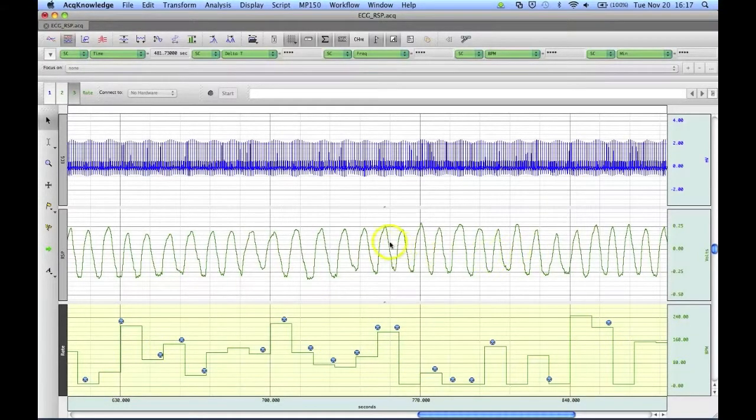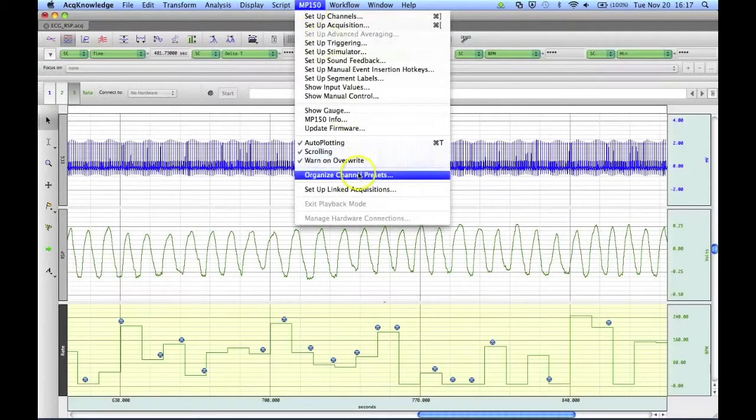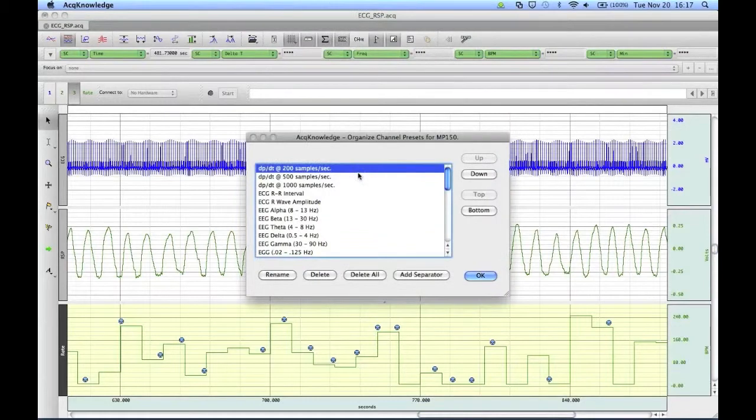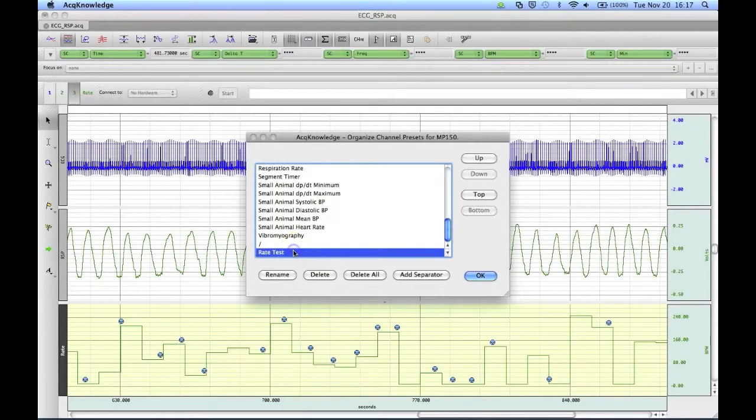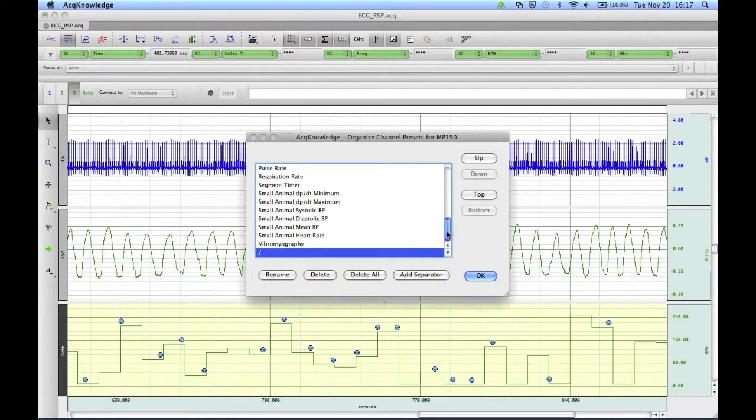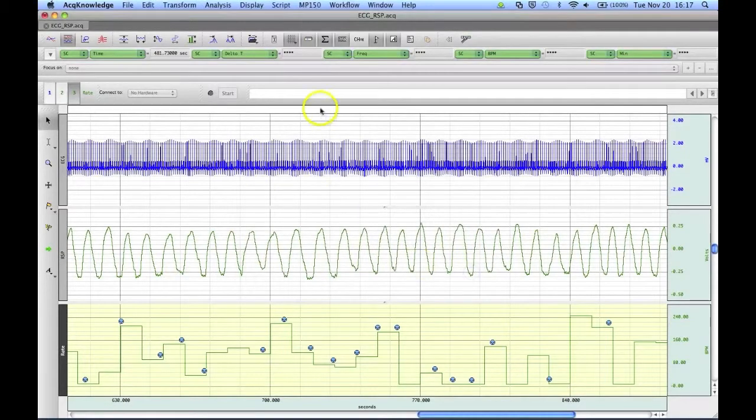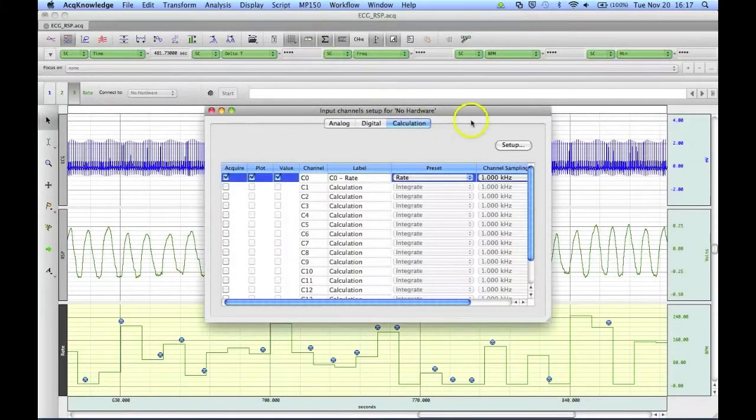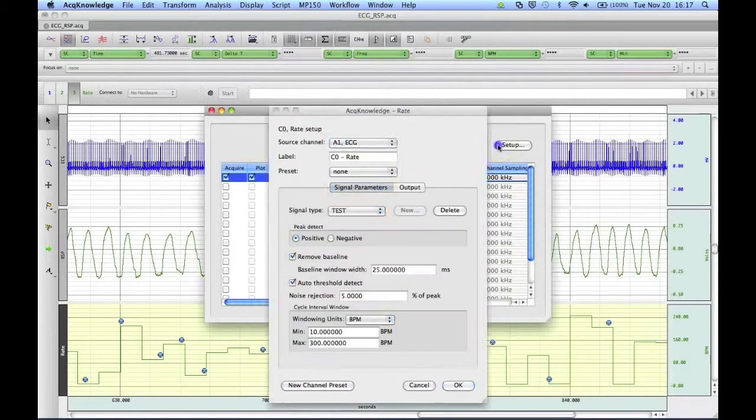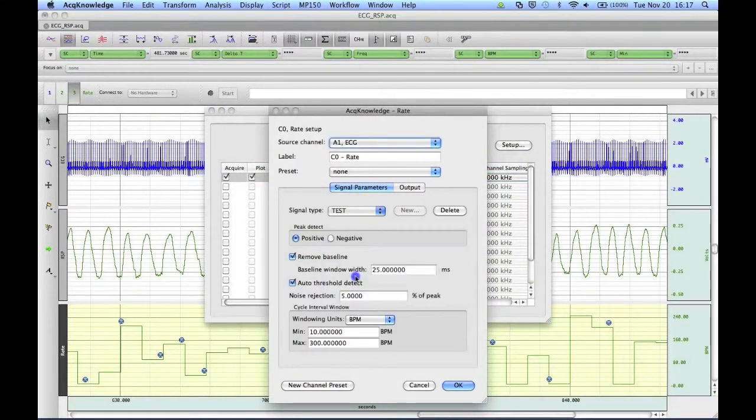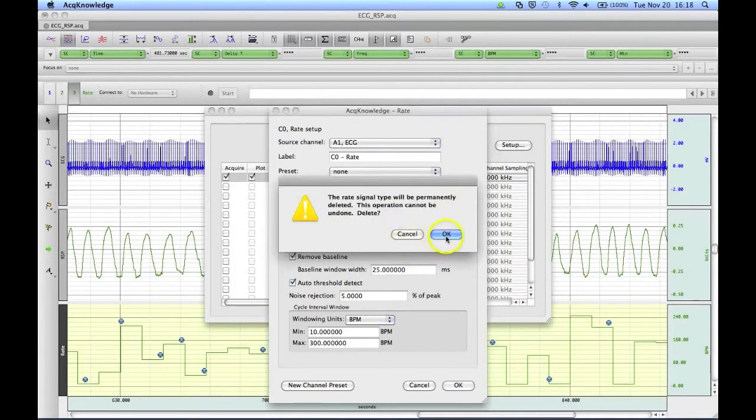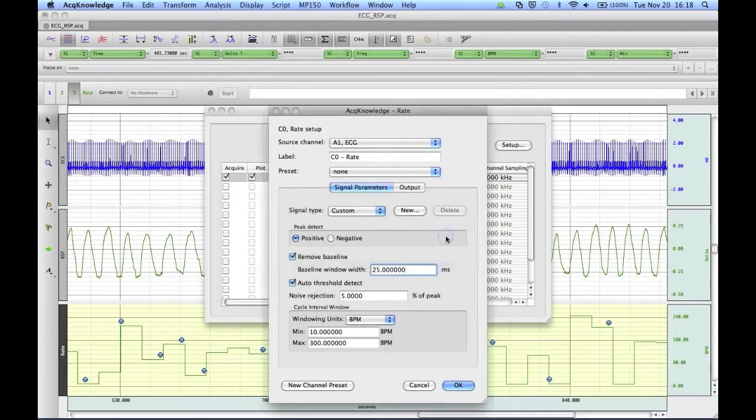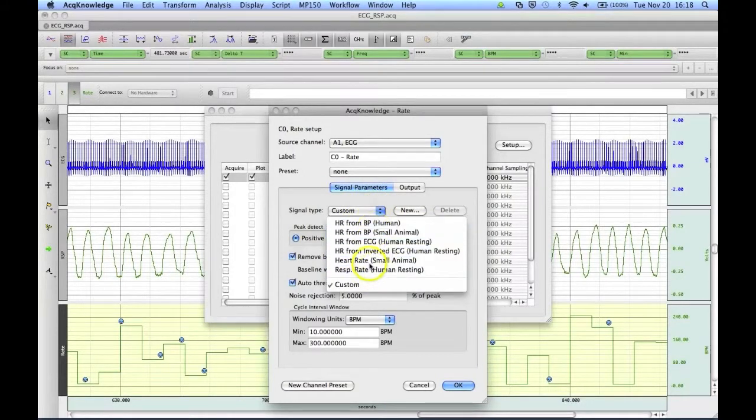If we wanted to remove the preset, we can do it two ways. We can go to the MP150 menu, go to Organize Channel Presets, and we can remove the online rate preset test here by deleting it. You can also go back to Setup Channels, go into the Rate Setup option, and just delete the test signal type by clicking on Delete, and OK. And now you'll see that has been removed from our preset options.